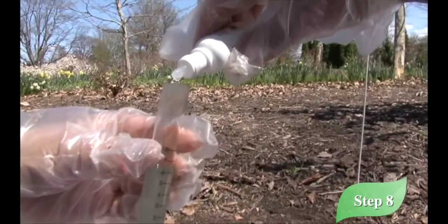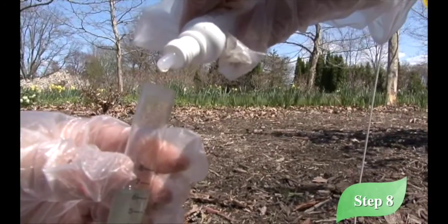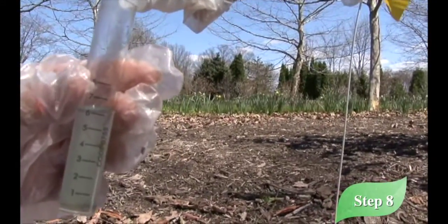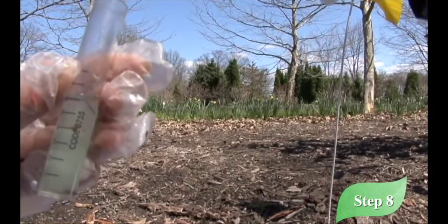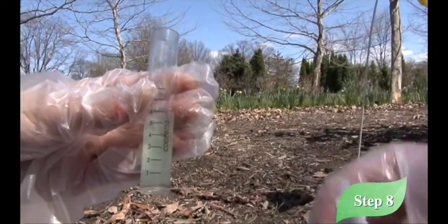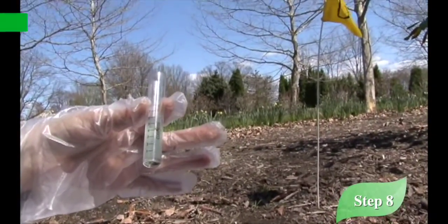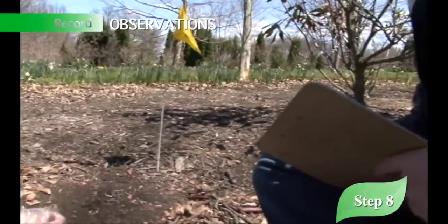1, 2, 3, 4, 5, 6, 7. Looks like it's turning blue. 8. Probably on that 8th one is about as blue as it's going to get. Okay. So once it turns blue, you have to stop adding when the color changes from purple to blue. Let's look, and can you record that it took 8 drops for us to get it to become blue. 8 drops.